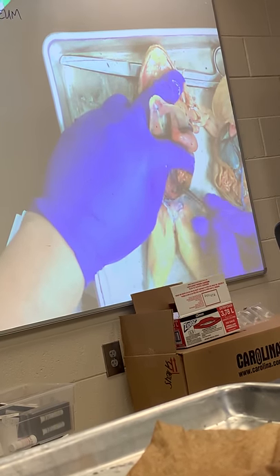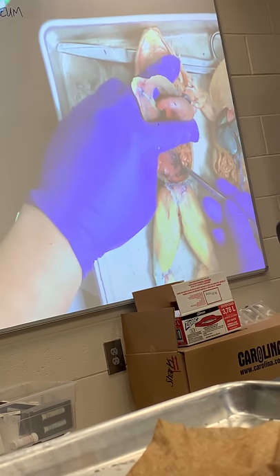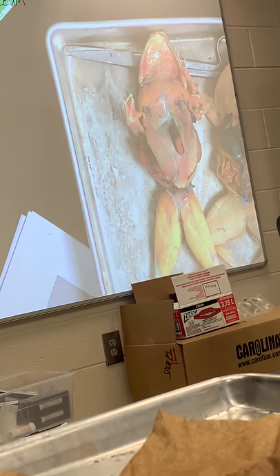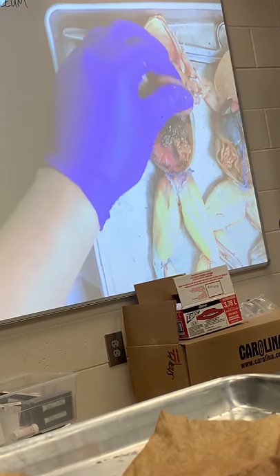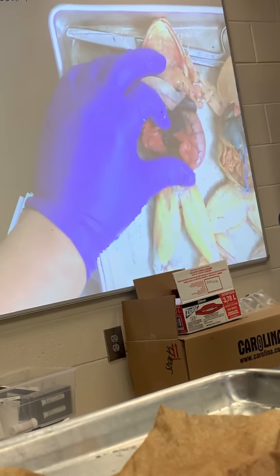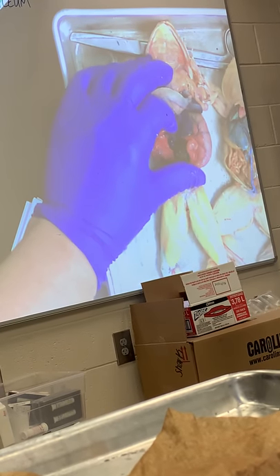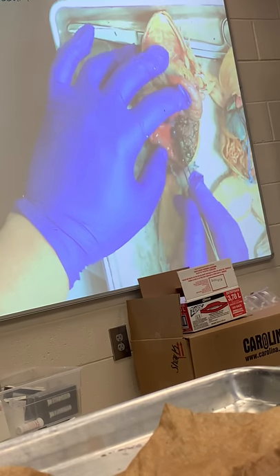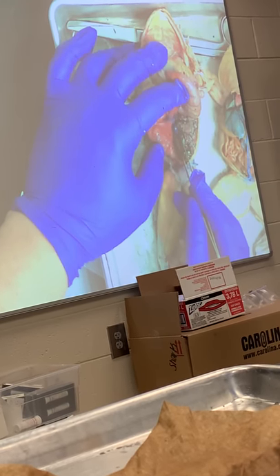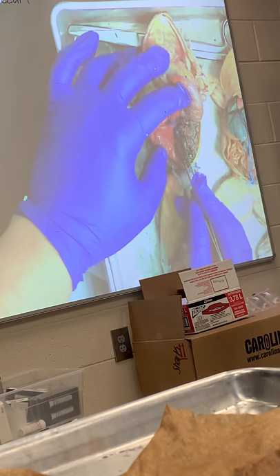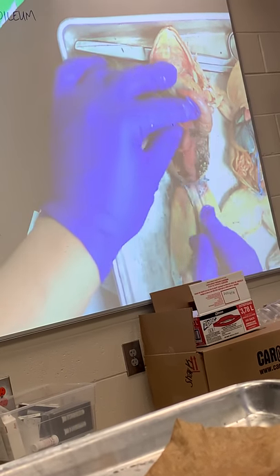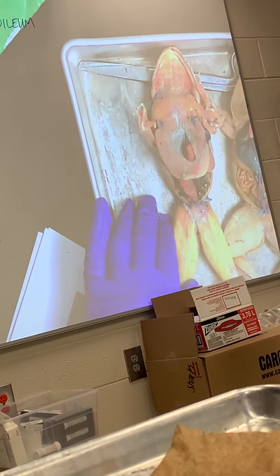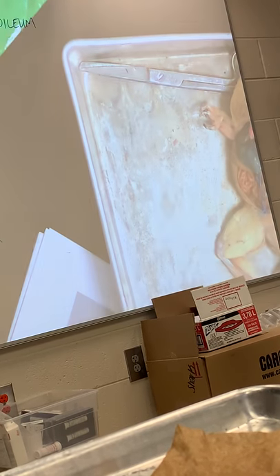There's this little brownish thing right here on the dorsal body wall — that is the kidney. There's one kidney on each side, and that's going to serve as a landmark for us. Another thing: if you pick up the stomach at the curve — the bottom of the J — and lift it up, you can see a little dark bulbous bean-looking organ. That is your spleen. I'd like for all of you to make this dissection in your frog and look for those organs.